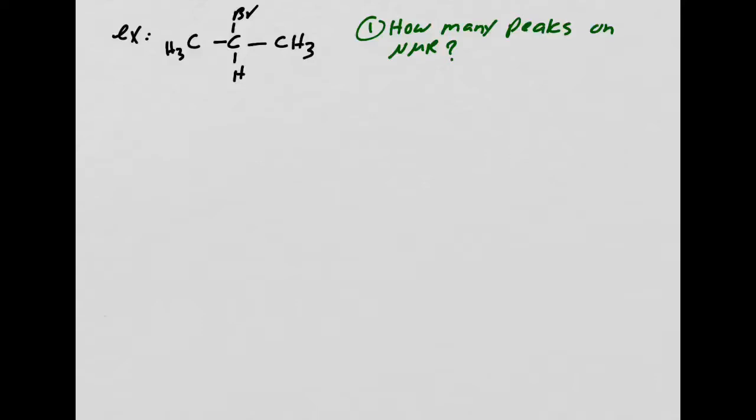Let's do it. Over here, these hydrogens are pretty unique, yeah? These are the unique set of protons. Now, this one is a unique set of proton. Do you agree? Okay. Now, how about over here? Is that a unique set of proton? That's actually the same as A, right? And hopefully you see it right away by now. And if you're not there, you will get there. Because, remember, look at the neighbors. So here, this CH3 is attached to a CH that is attached to a Br that is attached to a hydrogen. This is exactly the same. This CH3 is attached to exactly the same neighbor, right?